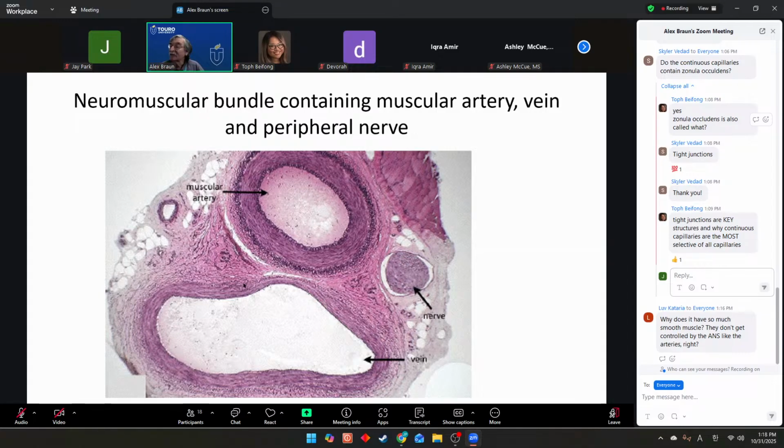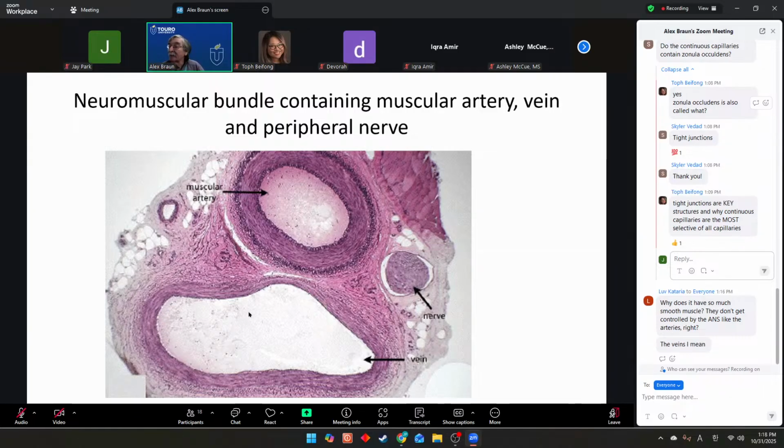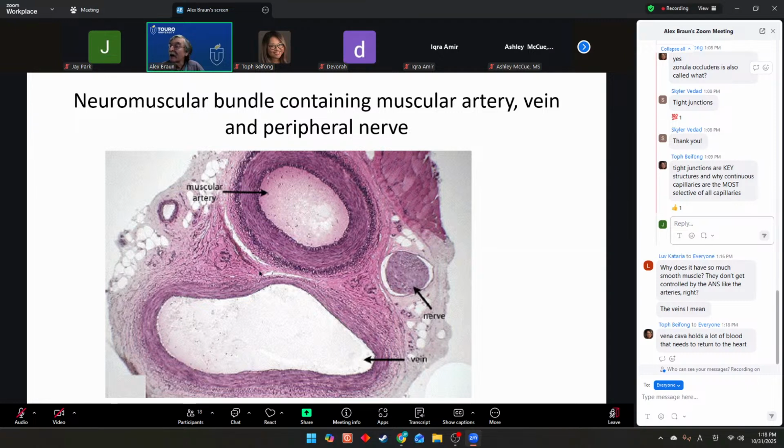okay? Next door to it, I see a vessel with a larger diameter, a larger lumen with a greater volume, which is what I would expect to see in a vein. I don't make out an easy to identify internal elastic lamina. I don't make out a well-developed muscular media. I think there is a media with smooth muscle cells in it, but I don't think it's as well-developed or easy to see as you see in the adjacent arterial vessel.